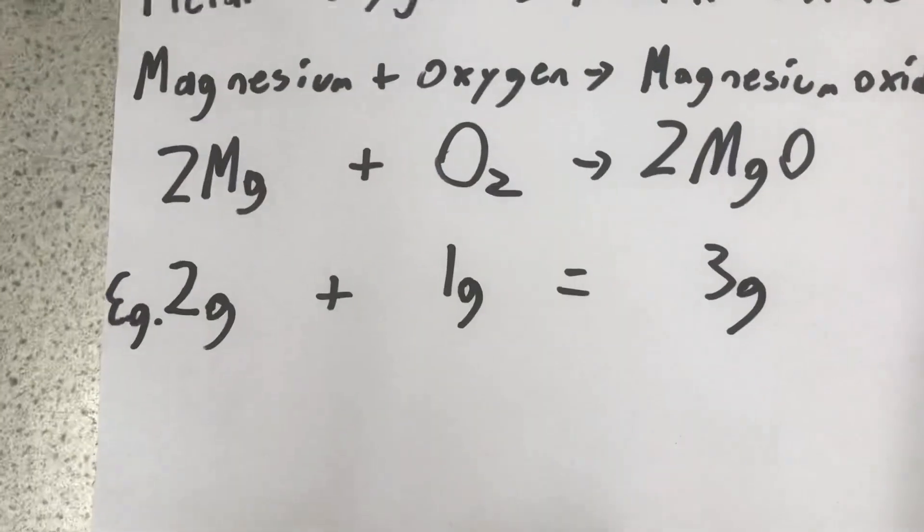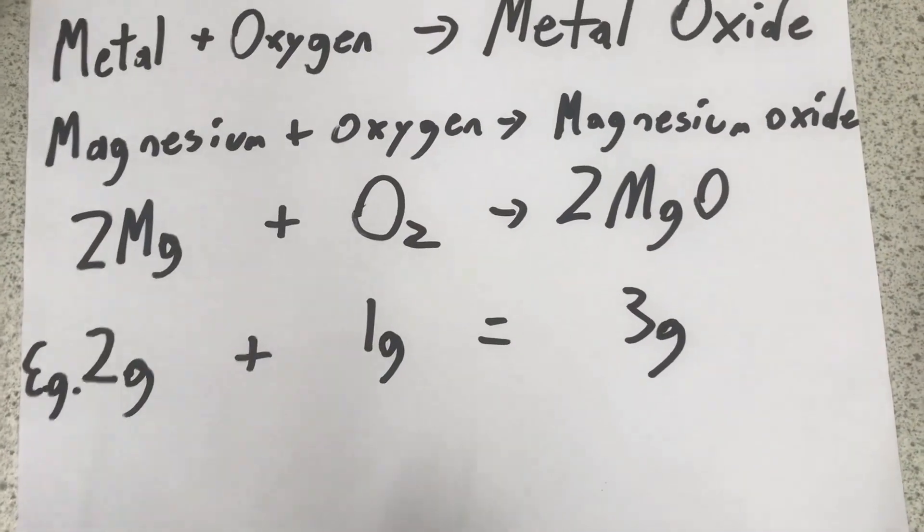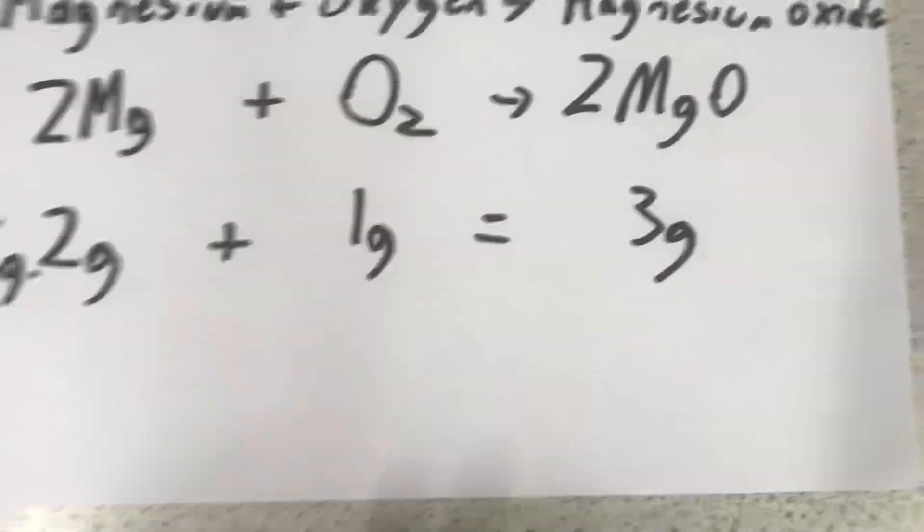Now, this time, I will be putting it over a Bunsen burner to add oxygen from the air to create magnesium oxide.